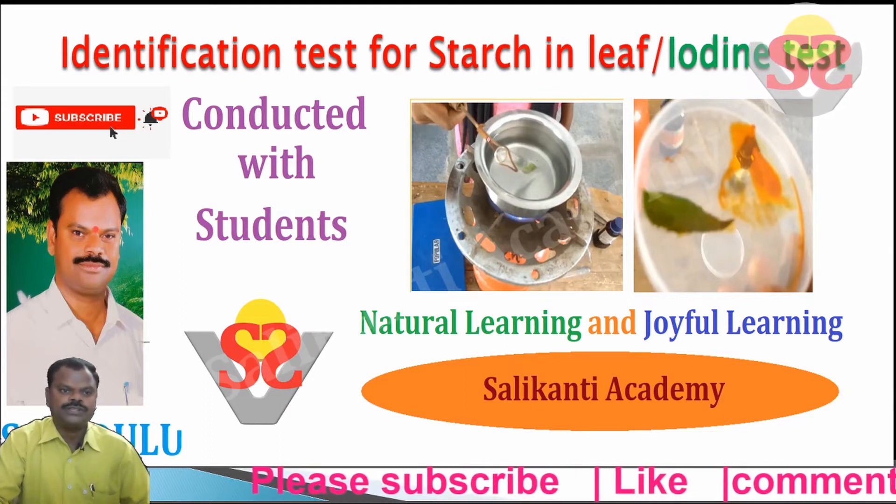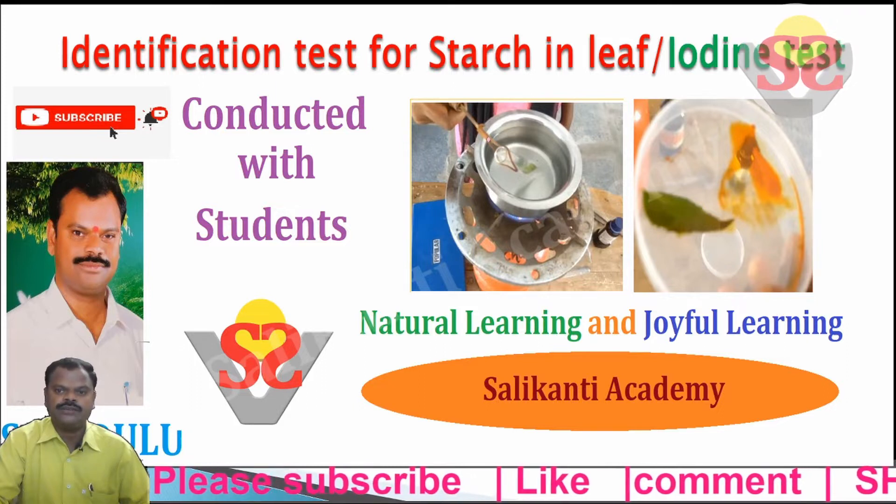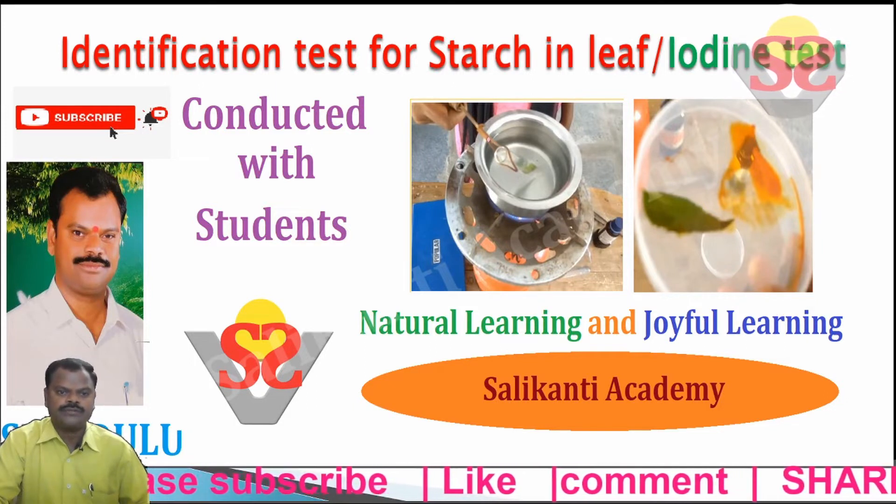Hi children and viewers. In this video we are going to do an identification test for starch in leaves, or iodine test, conducted with students.